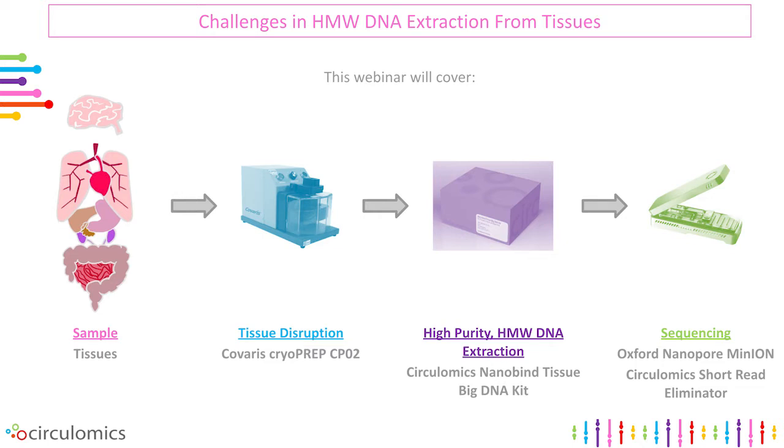Today, I will be focusing on DNA extraction from mammalian tissues. I will demonstrate a method we use for disruption, the results one can expect from Nanobind DNA extraction and size selection, and then show you examples of how this DNA performs in long-read sequencing on Oxford Nanopore MinION.